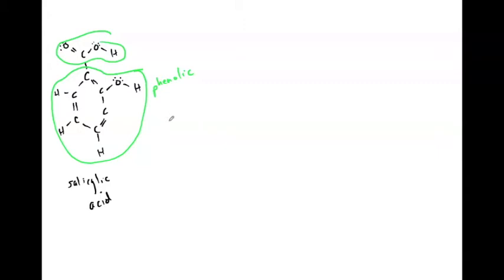So the Bayer company in Germany, I want to say just before the turn of the century to the 1900s, so late 1800s, decided that they could improve on salicylic acid, so they replaced this with the acetyl group to reduce the issues that salicylic acid has in people's stomachs. So let's go through the synthesis real quick and what we're going to do today.